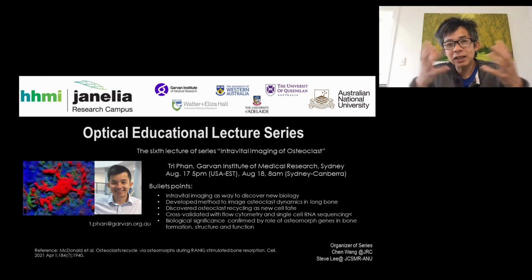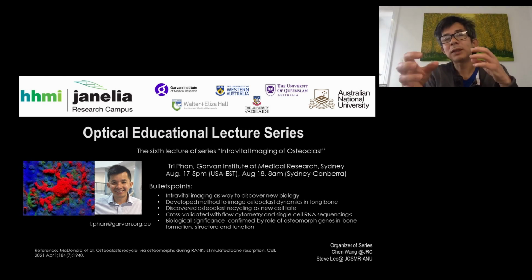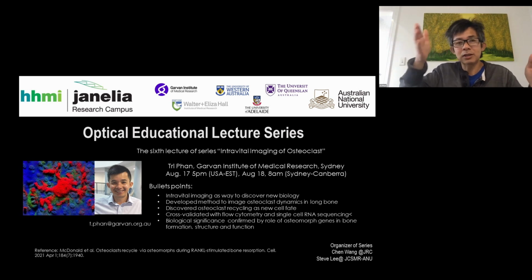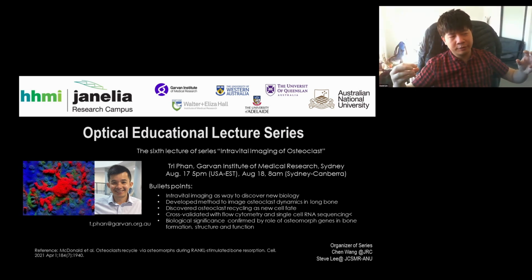So I just think in that environment, there may be a lot of reasons for the cell to want to fission, and what that fission might allow it to achieve. And so I'm imagining that it may well be that the fission products, the daughter cells, may be quite heterogeneous, not as homogeneous as that population that we saw quite tightly clustered together. And that heterogeneity might reflect some of the steps that you are alluding to in terms of their gene expression.